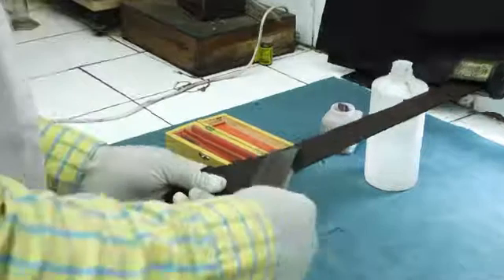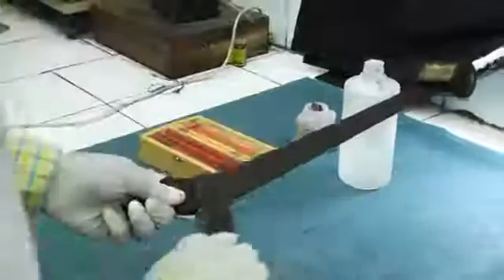inches. Technique. The knife is laid on the near end of the strop with the cutting edge towards the operator. The knife is held with the forefinger and the thumb. The action is the exact opposite to that of honing.